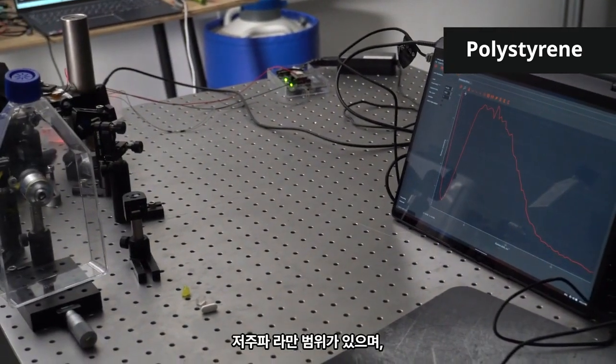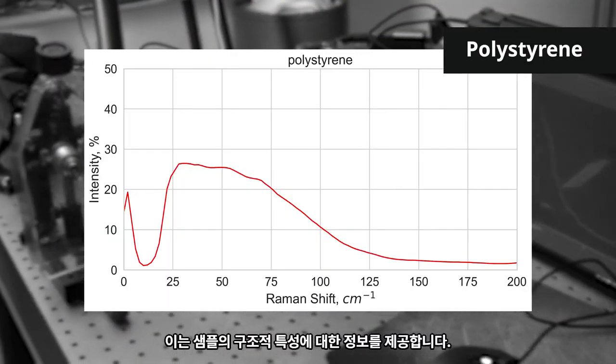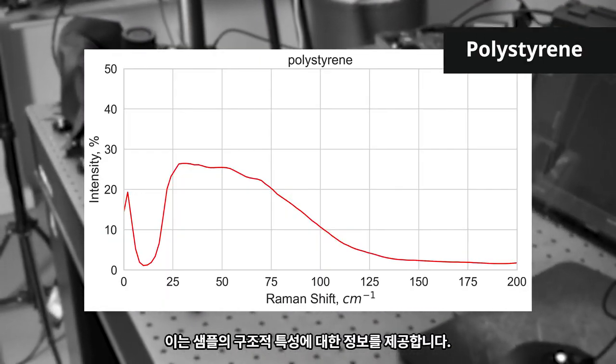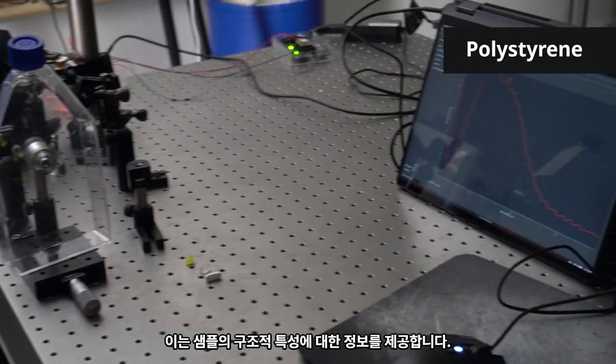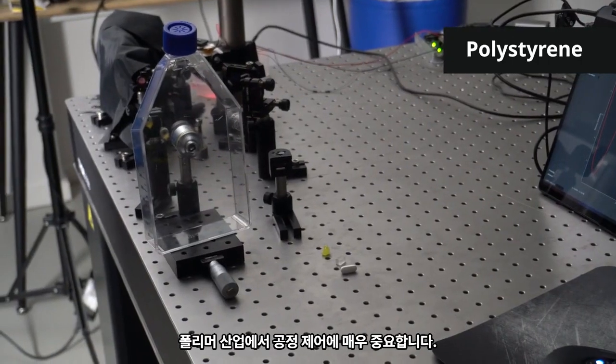And here's the low-frequency Raman range, with some Raman bands providing the information on the structural properties of the sample. This spectral range is extremely important for the process control in polymer industry.